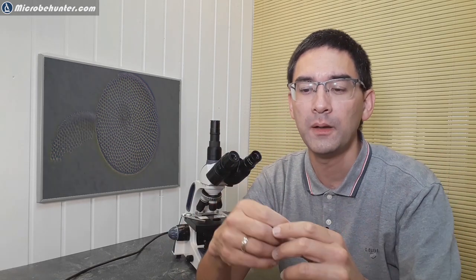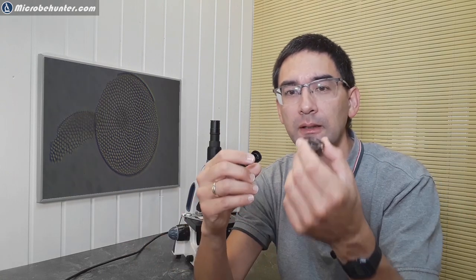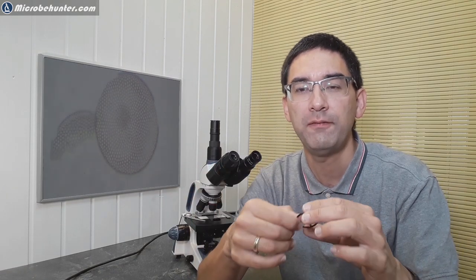If you forget that, you're not going to see anything. So you got to open the aperture diaphragm. And then you have dark field, and you rotate it out a little bit until you get oblique illumination. Oblique illumination also needs to be mentioned, works best with the 40 times objective, because with the 10 times and 4 times, you won't be able to see the shadows because of the low magnification. I mean, it also works, but you just won't be able to see the effect as much.